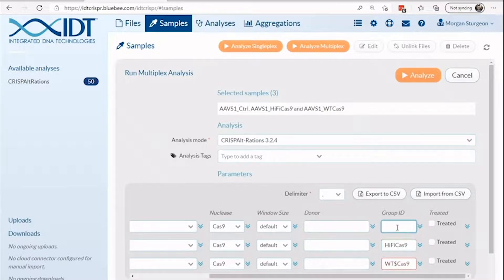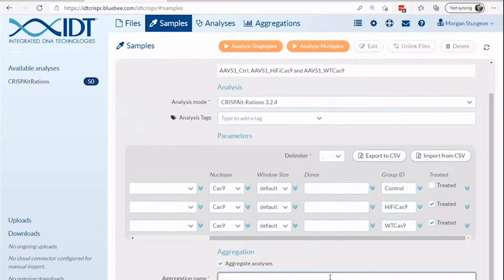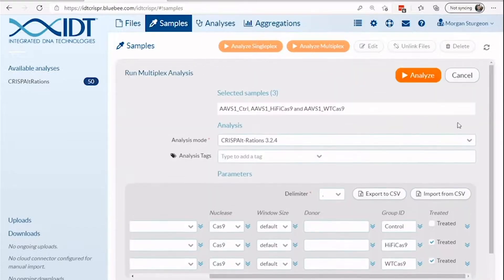Our interface looks for red flags that could prevent your analysis from being run successfully. Here you can see an example of a sample name that has illegal characters. After correcting this, you can then name the aggregation for this run, associate any metadata or descriptions for this experiment, and run the analysis.